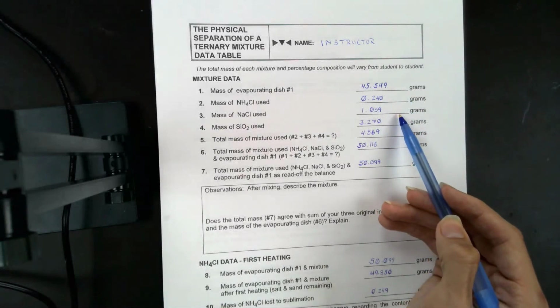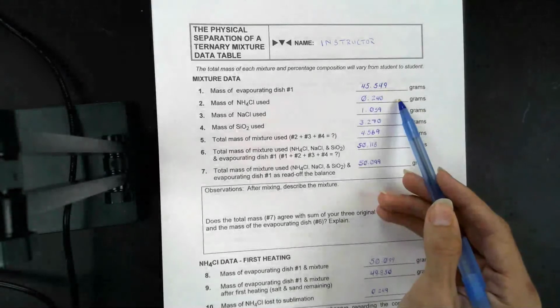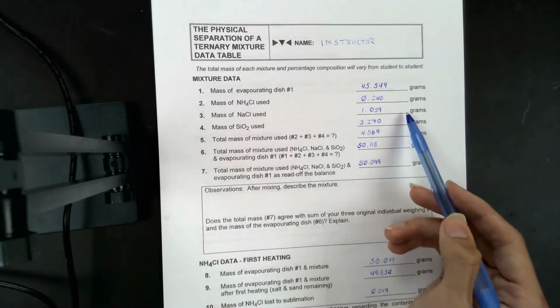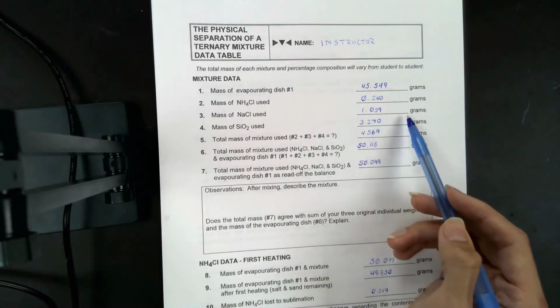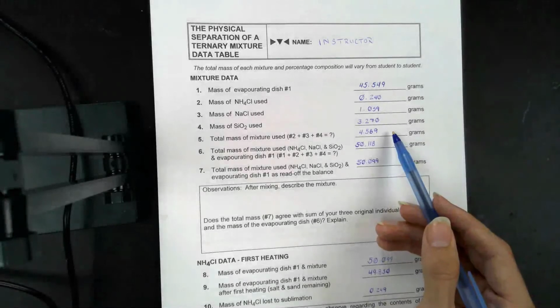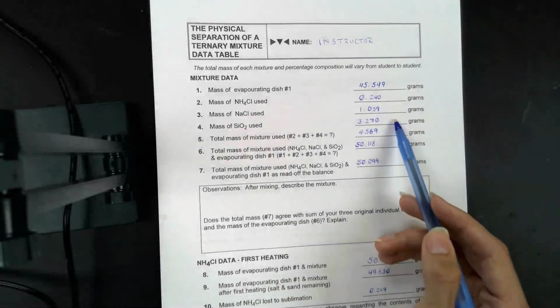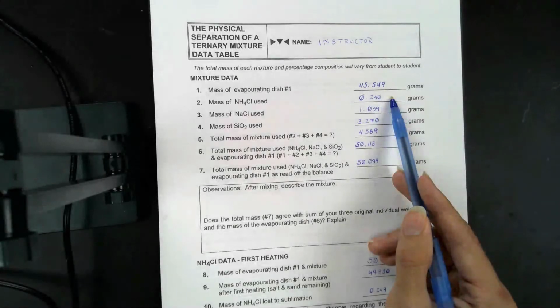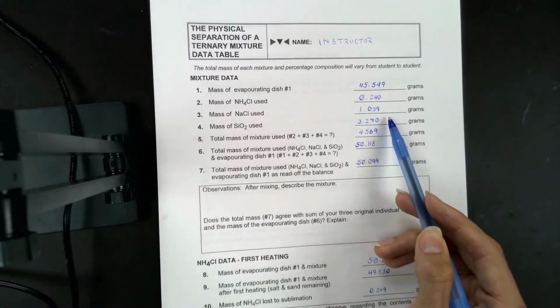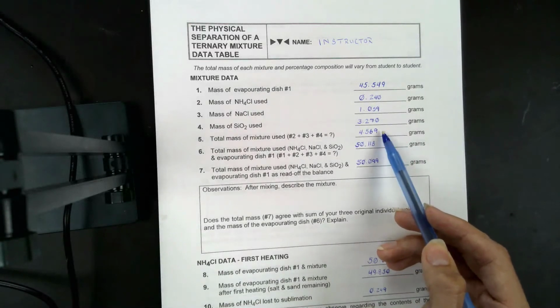If you remember, I showed a short excerpt with the spatula measuring out the ammonium chloride. I did that for all 3 of my components and just recorded the masses here. This is the total. Item 5 is basically the sum of 2, 3, and 4. It's the total weight of my mixture. So I just added the mass of the ammonium chloride, the mass of the sodium chloride, and the mass of the silicon dioxide, and that gives me the total mass of the mixture.